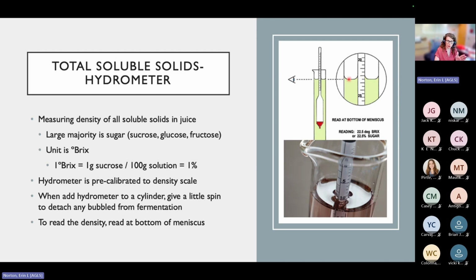And it's really important for any of these measurements, even with a burette when we get to titrations, you read from the bottom of the meniscus. So the bottom of that curve to get the reading that you want. So important here that you're reading from the flat surface that is beside the tube. Okay, not right up against the tube, but you need to look out a little bit farther to where the surface flattens out. Okay, that's an easy way.